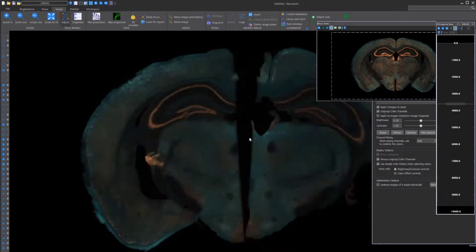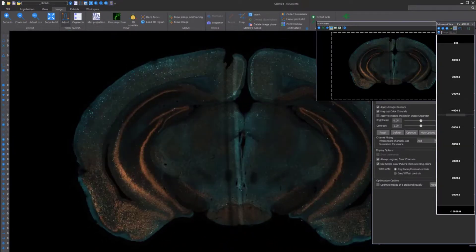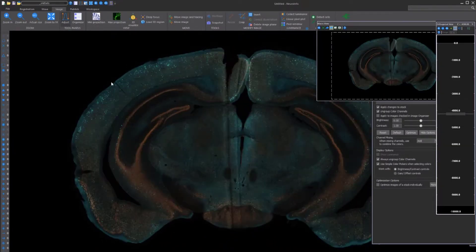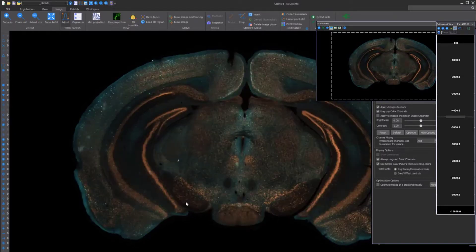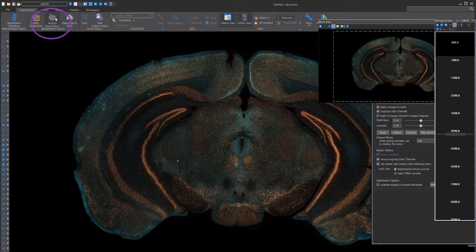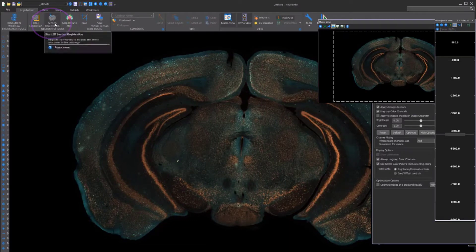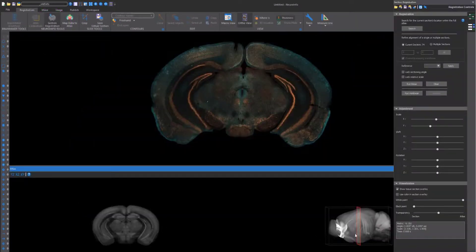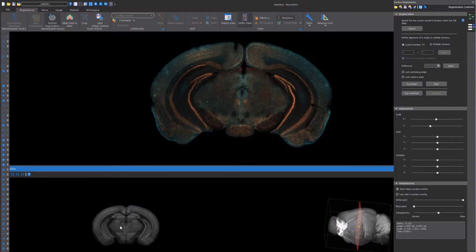To align your images to the atlas, find a section with clear anatomic features that go dorsal to ventral. Once you've selected a section, click on Section Registration. This is where you'll match your image to the atlas, which is an average composite of over 1,500 mouse brains.